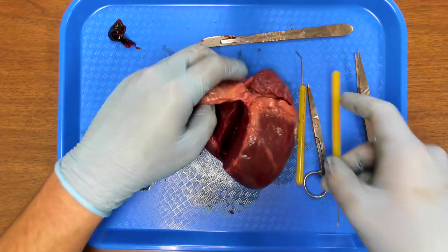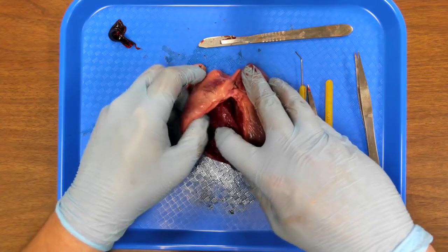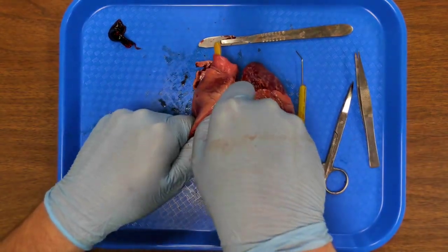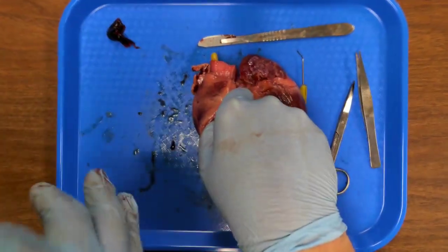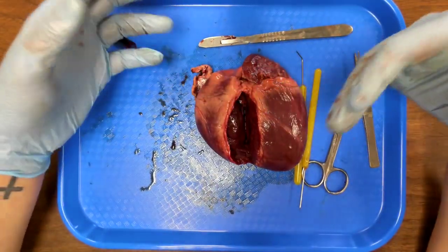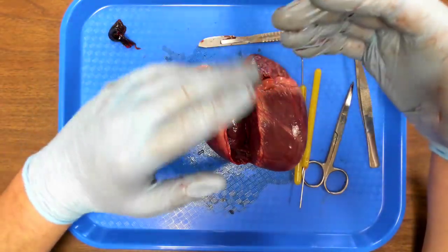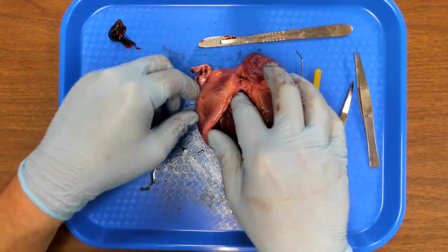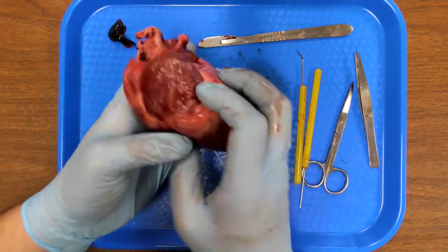What this, where this is going, blood is being pumped through this right ventricle, and it gets pumped out through this pulmonary artery here, and it gets taken to each lung. Okay, inside the lungs, that blood drops off carbon dioxide that is a waste product from cellular respiration. Those cells give that off, and it picks up oxygen. Now, after it has picked up oxygen, it comes back.